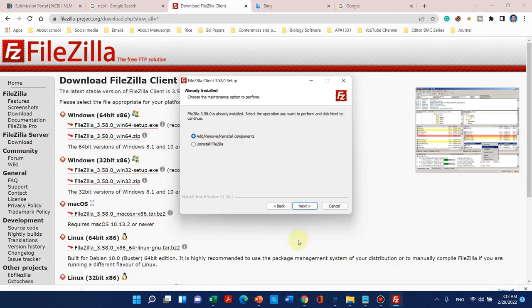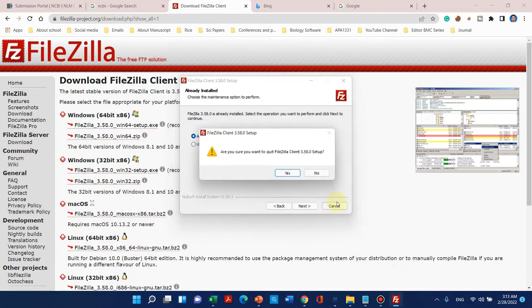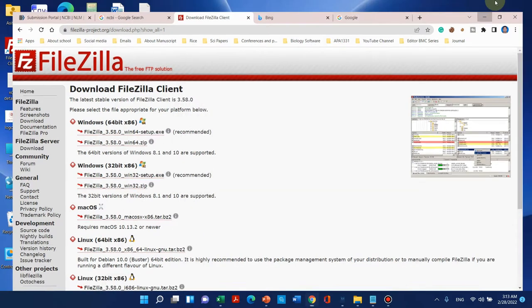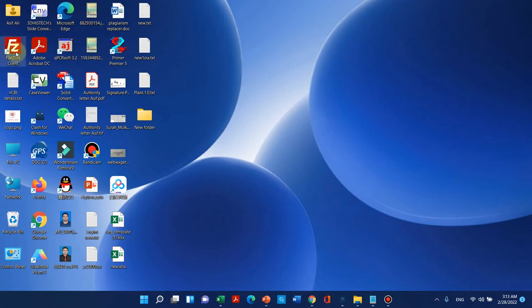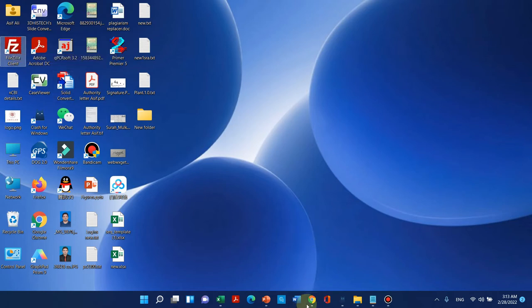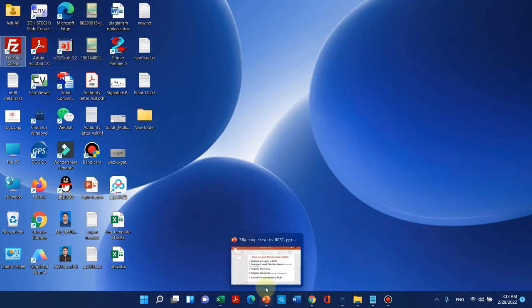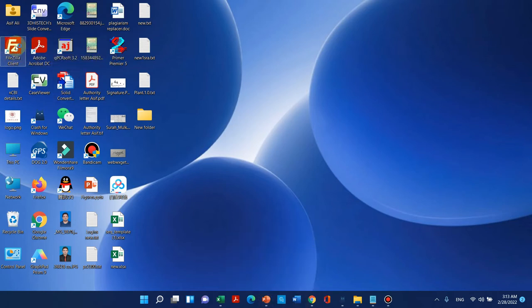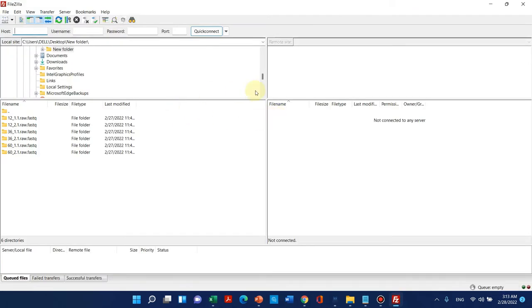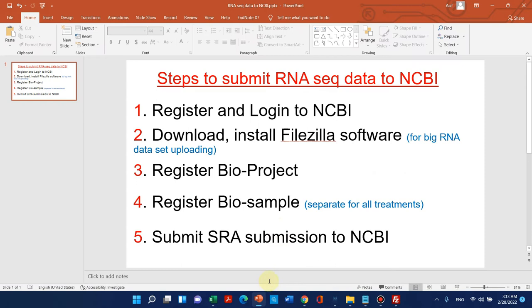I have already installed it, so I don't need to install again. I can show you that software. This is the software, but we will use it at the end of the submission. We will connect to the story at the end of the submission. So now we should move to our third step.